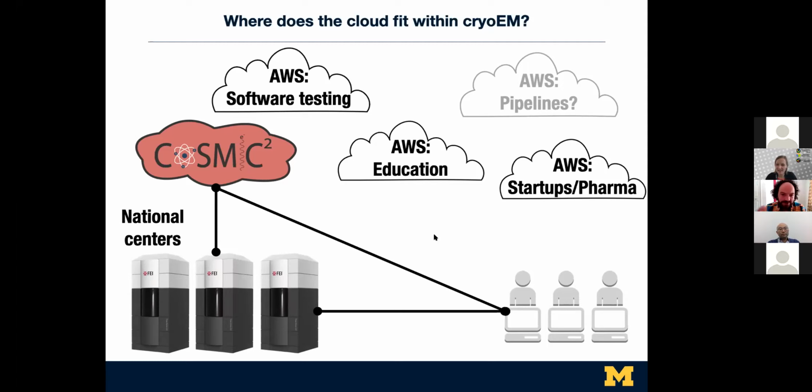If you have Globus on your end or wherever you are, it will move the data, and it will be as slow as the slowest bottleneck for the internet. So the limitation is it would move in and live on our server, so the limitation is just your local connection. Yeah, or if it's going across the oceans, that's usually a slow step.